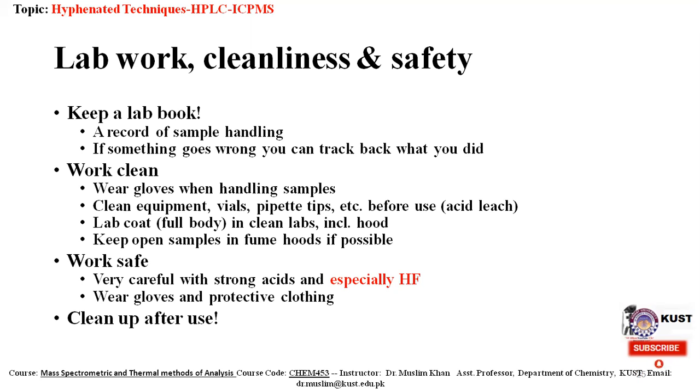Also, wear gloves and protective clothing. And when you perform your experiment, clean up after use. So these are the simple things you have to keep, because as an analytical chemist, when you want to work in a very accurate and precise way, you have to clean all the things properly.